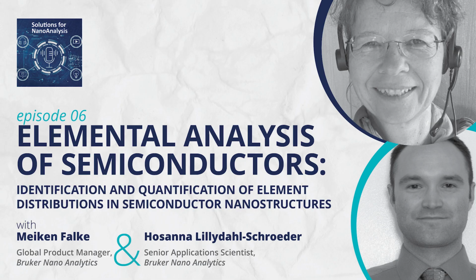And it is particularly good for TEM because of the low background. So EDS is absolutely ideal because of a high peak-to-background ratio for electron-transparent samples. And TEM is needed for high spatial resolution. And therefore, EDS in TEM is the ideal tool and used a lot in semiconductor industry.